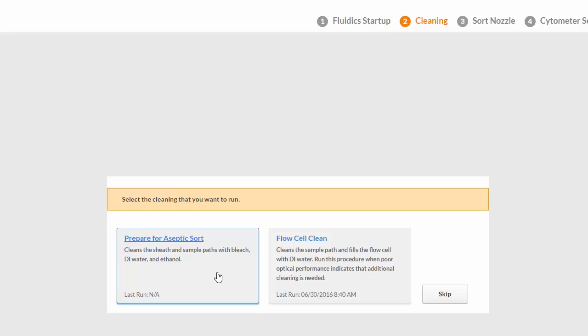If you are performing an aseptic sort, click Prepare for Aseptic Sort and follow the prompts. Refer to the user's guide for more information.